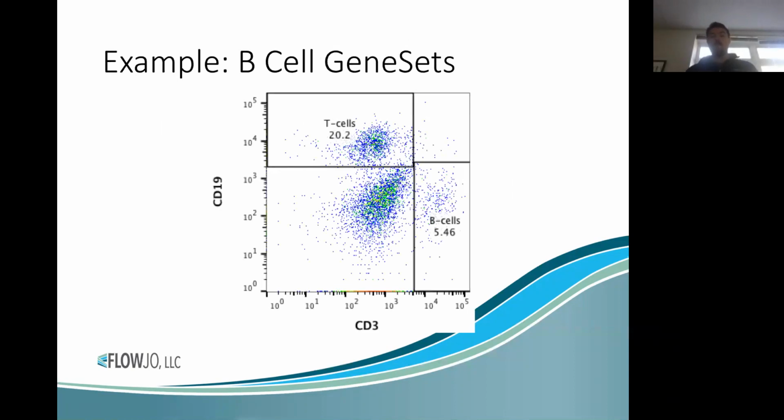Going forward, I'm going to be referring back to this example a lot, mostly with regard to the B cells identified here. Now, this data set was provided, I believe, by Stoeckius et al., who did some really cool antibody barcoded sequencing work, wherein they tagged cells with antibodies bound to oligonucleotides as a way of barcoding those antibody-bound cells so that we could later identify the protein content as well as the whole transcriptome of those cells.